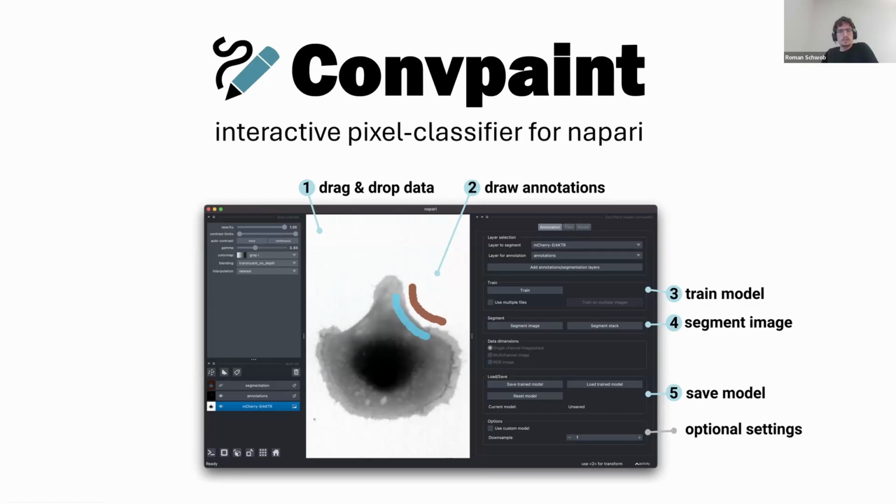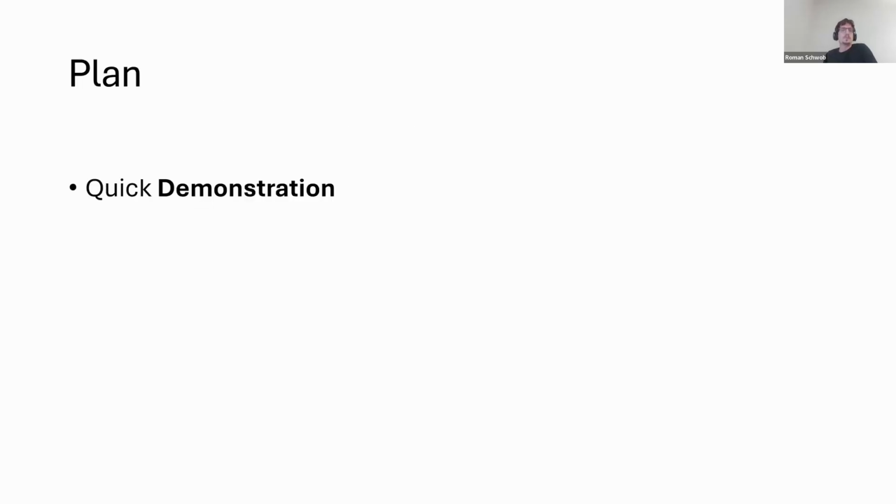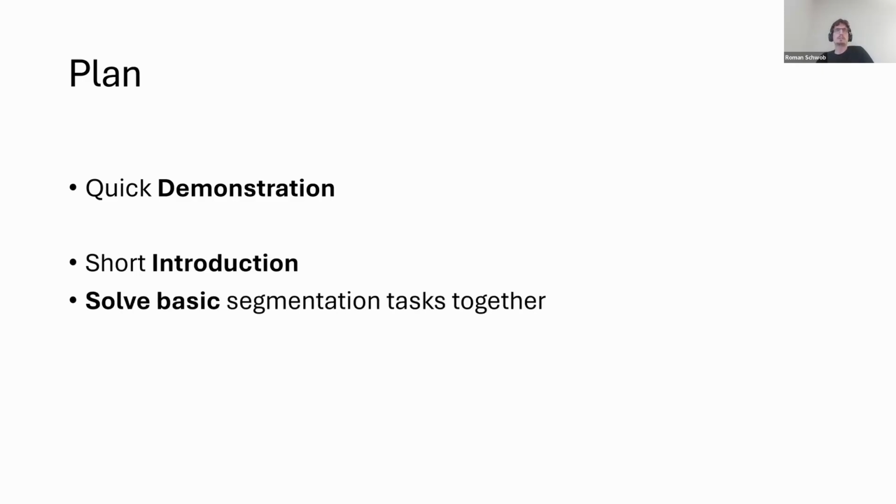I'll start with just quickly giving you an overview of what I've planned. I'll start with a very quick demonstration, so you'll know in a nutshell what this is all about, just so you can refer to everything afterwards. And then I'd like to give you a short introduction to the most basic background information, so you can understand the tool a little bit better, and maybe then also see its advantages more clearly, and also understand the tasks that we're going to solve together.